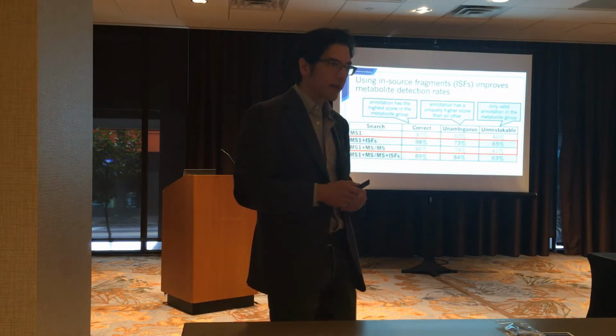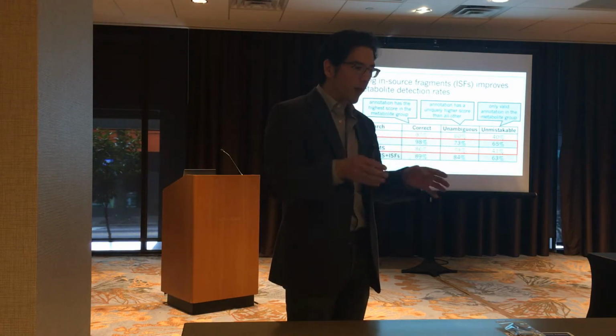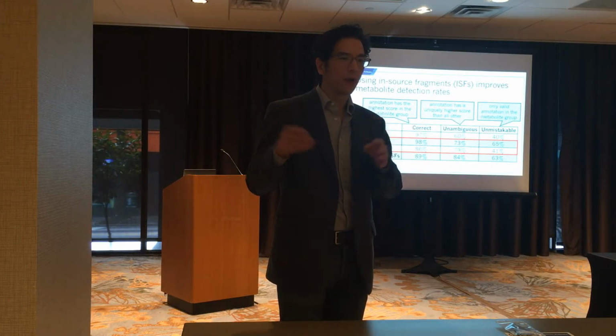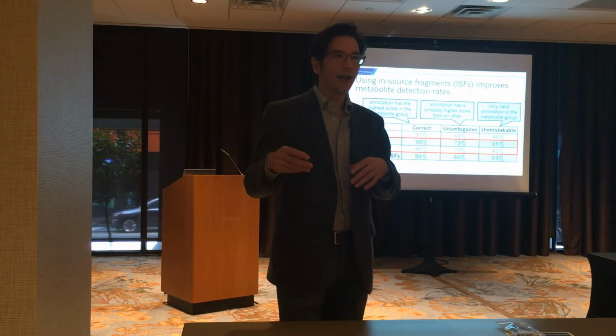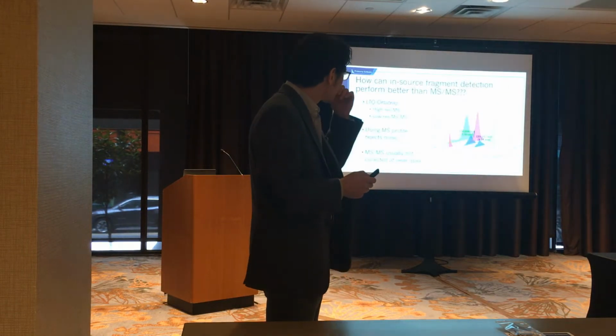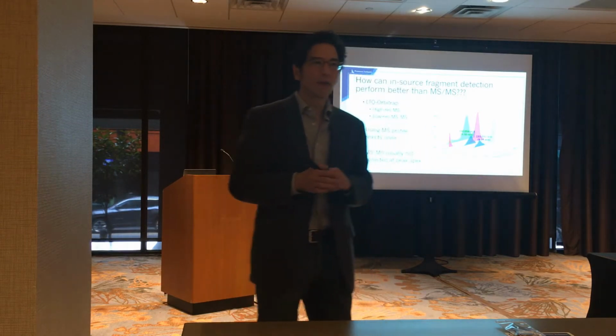So this was kind of exciting to us, the ability to say we're able to do as well or potentially even better in some circumstances if you don't collect MS2s and just analyze the MS1 data. We're more confident in the results. So that was a little shocking to us. But there are actually a lot of reasons why that might be.